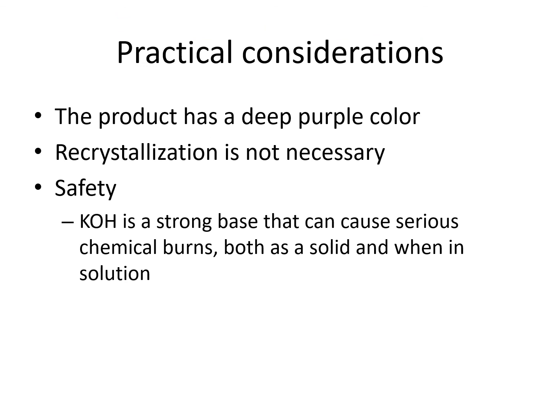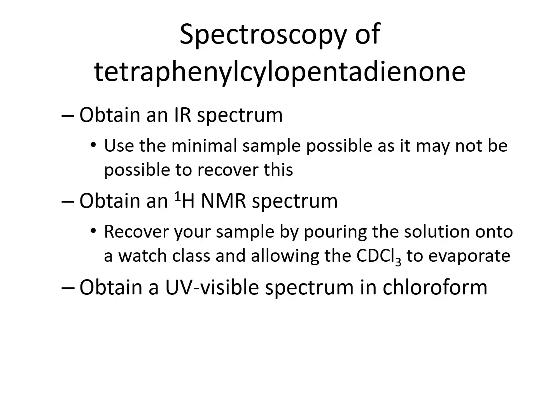So, practical consideration: the product has a deep purple color as we said, and recrystallization is not necessary. For safety, KOH is a strong base that can cause serious chemical burns, both as a solid and in solution. Remember to get the IR and the proton NMR spectrum, and for this molecule we will also be able to get the UV spectrum in chloroform.